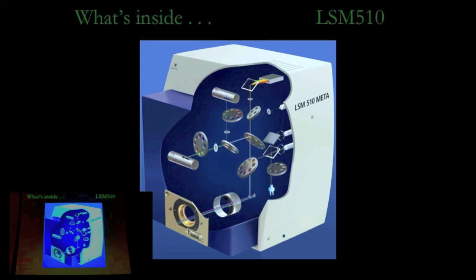And then it's attached to the side port of the microscope and gets reflected up to the objective, illuminates the sample, and then the emitted light comes back through that same path. It gets focused down onto the mirrors, bounces off of them, and then passes through. The rest of the optics then are designed to separate the light out spectrally and send it to one of the 3 detectors. There are various schemes in different scopes. This particular model is using dichroic beam splitters and bandpass filters to select the light that's getting to these 2 detectors. And up here, there's an array of photomultiplier tubes with a grating out in front of them.